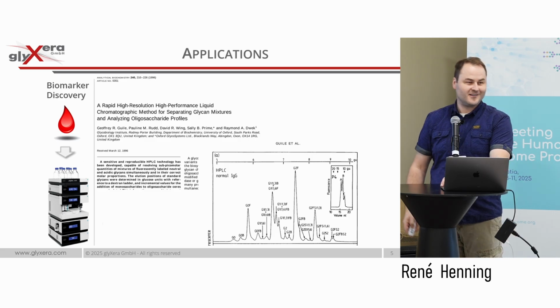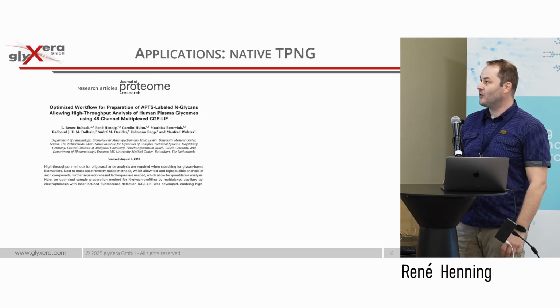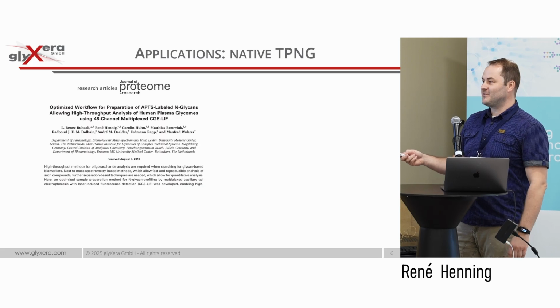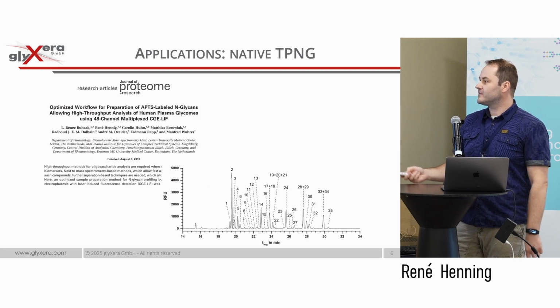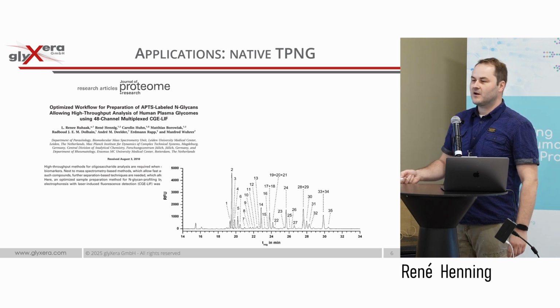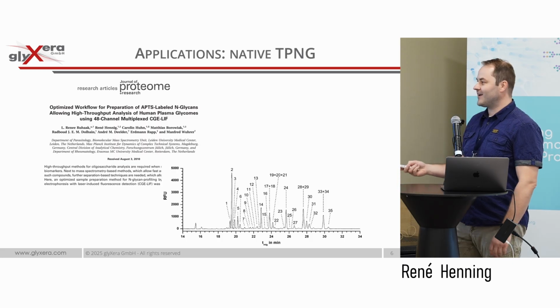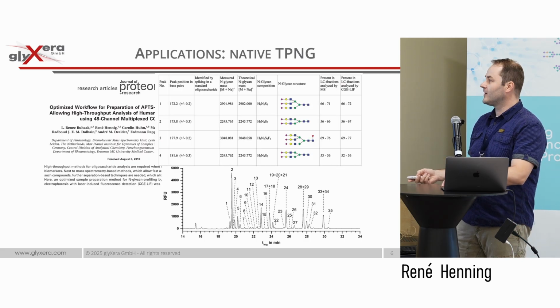So I have to say thanks, Pauline and co-workers, they actually started with it. And we also started not so long ago, but a long time ago, in 2010 already, we published the initial method where we used this multi-capillary electrophoresis instrument, and this is the electropherogram, how it looked in 2010. I was here for a visit in Manfred's lab, one of the most productive times in my life. We managed a lot within a short time, and this is how the electropherogram looked.